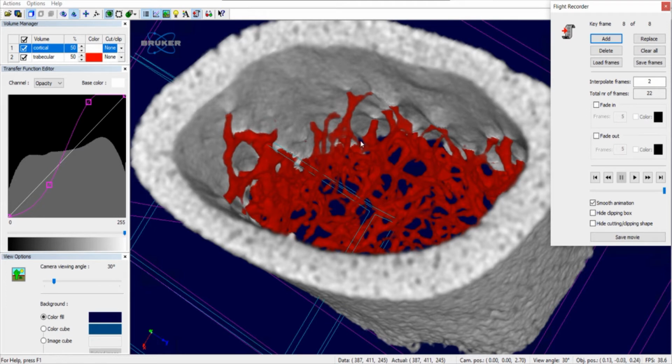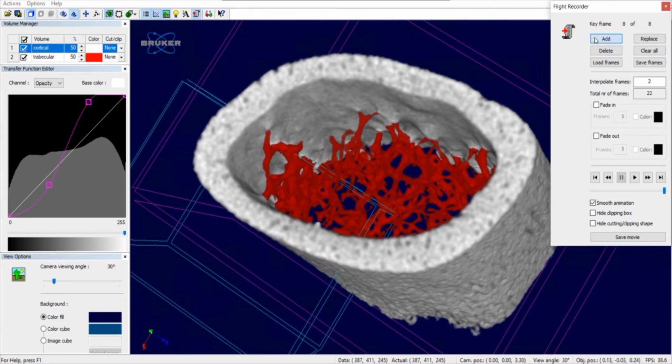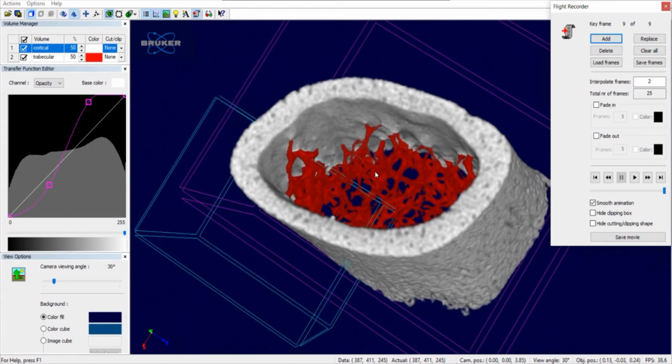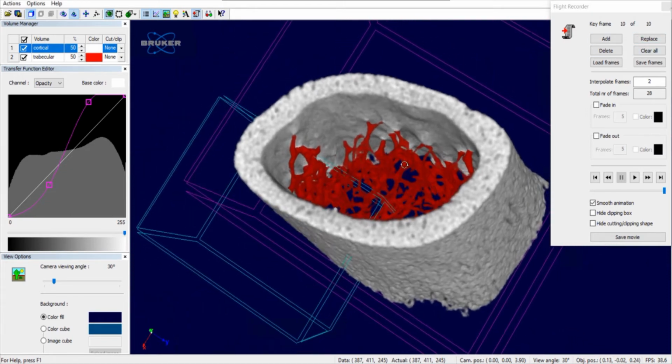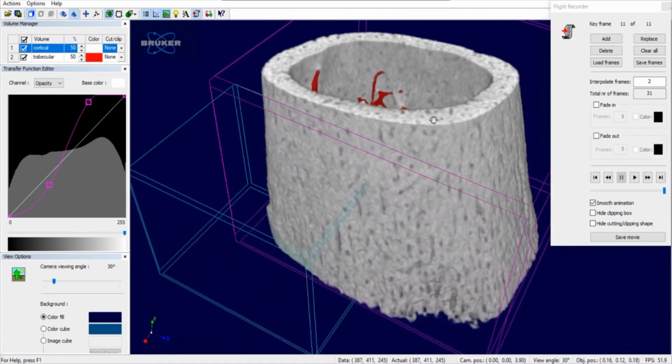Okay. Let's do another thing now. I can, for example, now zoom out. I will be a little bit faster. You can make more details in your video. I'm not going to take so much time here. Keep on doing this.